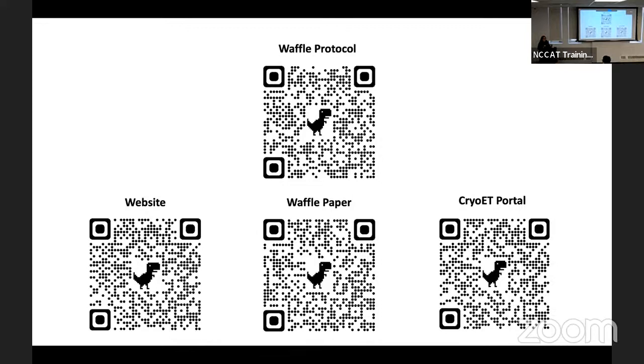No, I use a stereoscope, so I put it in the regular clipping station. After I mark it with Sharpie, so I can see where the notch is when it's in the proper orientation, you put the grid on, look in the stereoscope, and with tweezers, you just move the grid. Sometimes it moves. The way we have our setup right now, our stereoscope has a little lip, a platform that you have to put the clipping station on. So I have to lift it up and move it, do it, and then slide it off really gently in order to access the middle part for clipping. So that's a slight flaw, so we can figure it out later maybe.